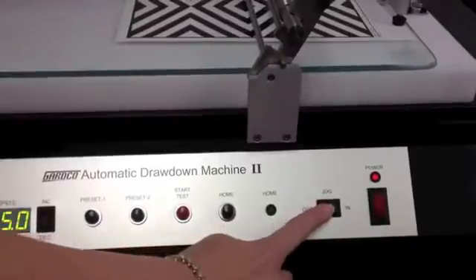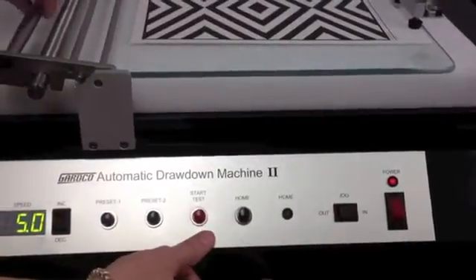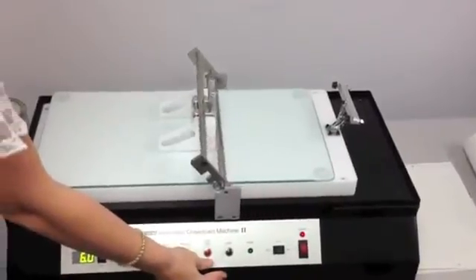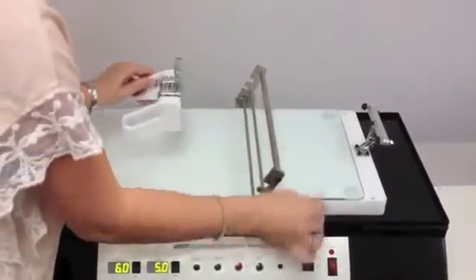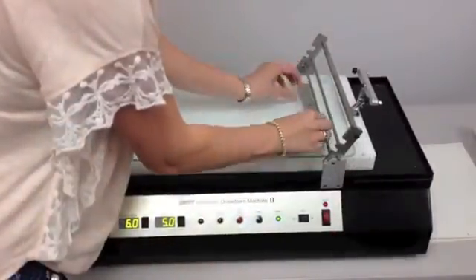If desired, the jog switch can be used to start the drawdown over any particular area of the substrate instead of starting at the very top. Finally, here is an example of how to use a Micron film applicator with the automatic drawdown unit, as well as how you would use a bird type applicator.